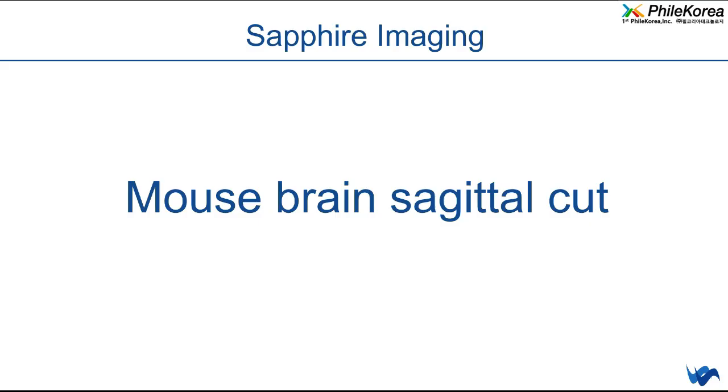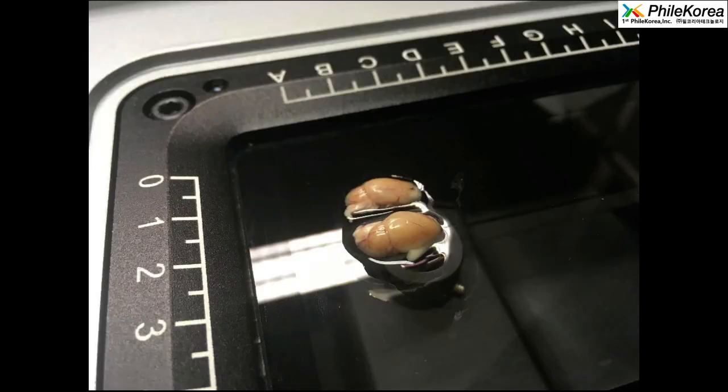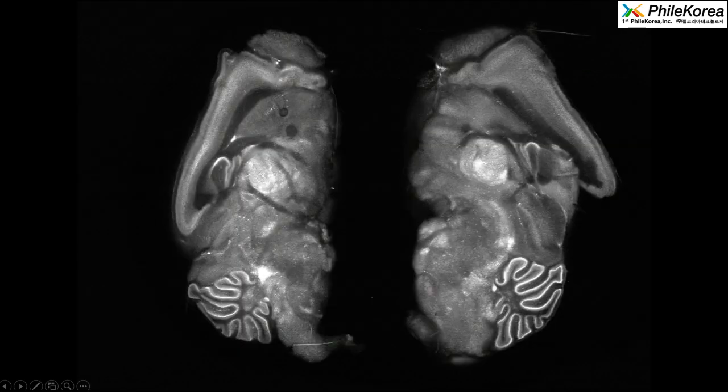What about mouse brains cut sagittally? So a full-size mouse brain cut sagittally. We put it on the scanner. Also here you see I'm using water for this water drop effect. And there was also a GFP fusion protein expressed mainly here in the cerebellum.